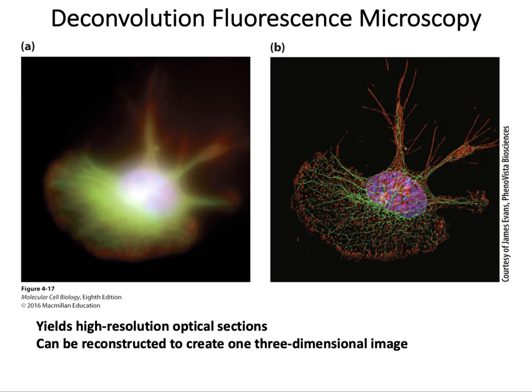However small it is, it could be 5 micron thick, which is literally a slice through a plane of a single cell, but there is a thickness at the microscopic level. Now, let's say you took that 5 micron slice of the cell, fixed and labeled the sample with fluorophores and observed the sample with conventional fluorescence microscopy. Now remember that the sample is 5 micron thick.